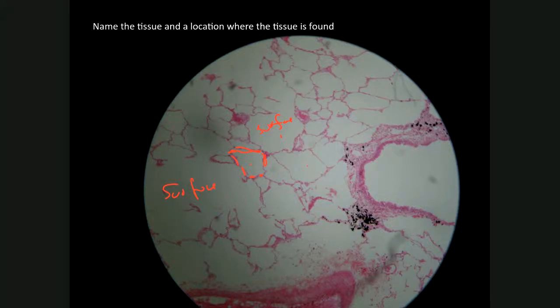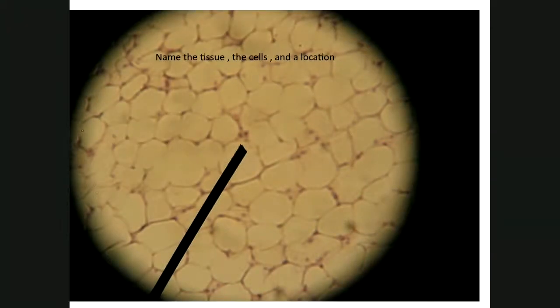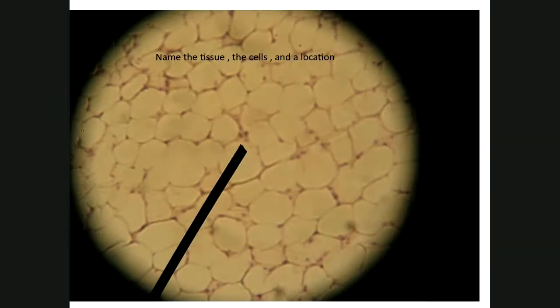Now, contrast this tissue with this one right here, which you may think looks similar, but in this case, the empty-looking spaces are circles, which are cells. Notice that in the previous tissue, the empty-looking spaces didn't quite make a circular structure of a cell. It made more of a sac-like structure. Some of them were bigger, some of them were smaller. So look at these. This really doesn't look like cells. This is more consistent. The shapes of the cells are a little bit more consistent, are circles.